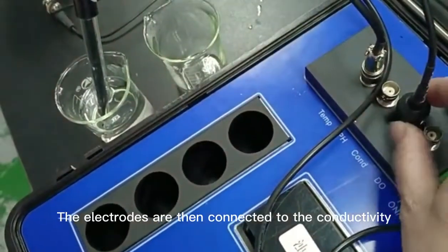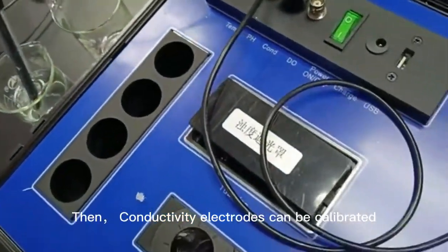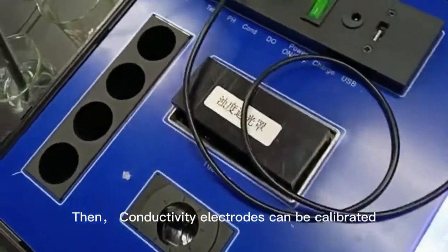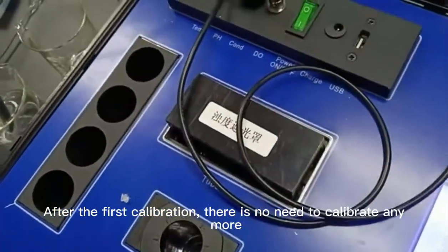The electrodes are then connected to the conductivity meter. Then, conductivity electrodes can be calibrated. After the first calibration, there is no need to calibrate anymore.